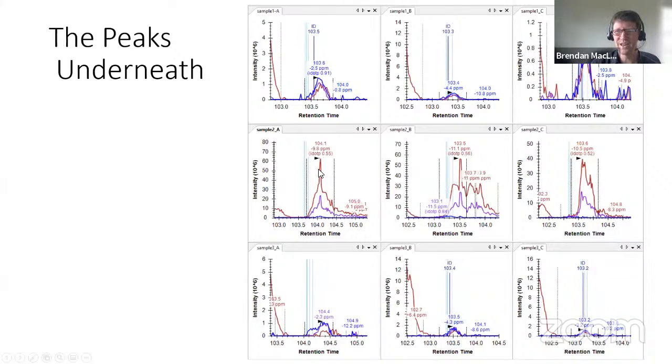But when we look over here, we don't see any IDs, and we see very different peaks. There's some big brown, something that is apparently heavier than our thing, because the blue is the monoisotopic, the purple is the M+1, and the brown is the M+2. And so we see that this is probably caused by some heavier thing or something like that.